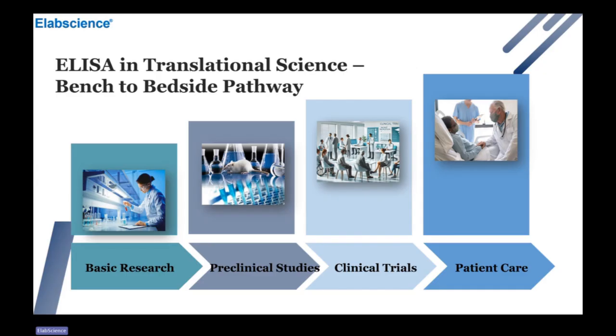So this pathway is how translational science works, and how reliable protein measurement accelerates bench to bedside translation. Using ELISA effectively at each step strengthens the overall impact of your research.